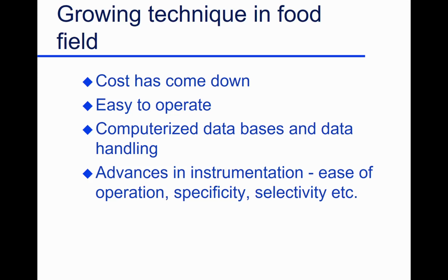And so what we were doing is we spray dried it. So we got a nice dry emulsion. So there's enough solid material in here that we get a dry particle, and we'll have droplets of oil throughout. We break a particle in half so we can break some of these droplets in half. And this was an oil droplet, but we've evaporated the oil out of here, and then we're using a mass spectrometer to come along and keep on bombarding this and doing imaging just like I showed. And so when this was an oil droplet here, we can see what was there, what's the residue, what was the interface. Really fascinating.